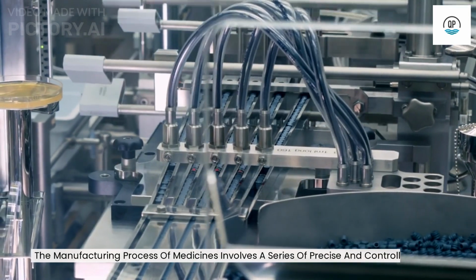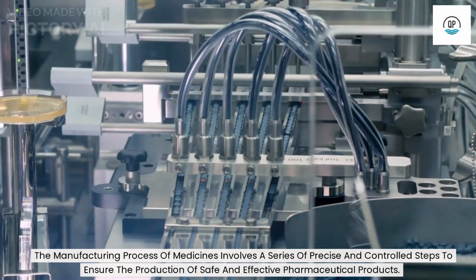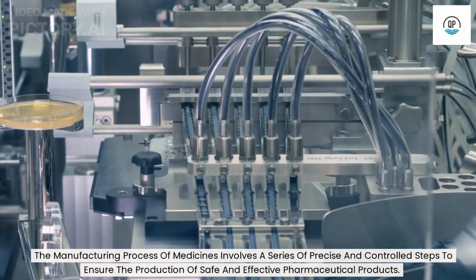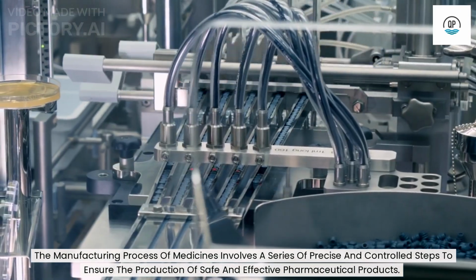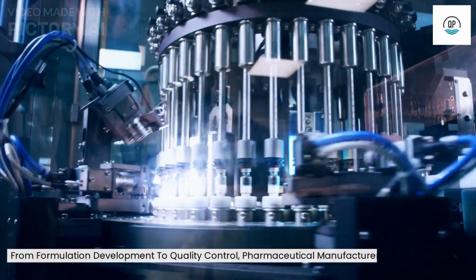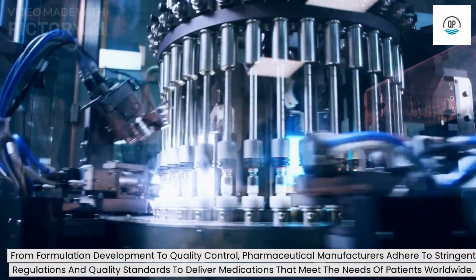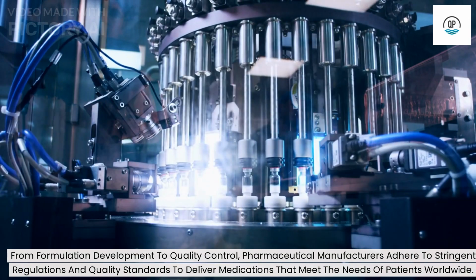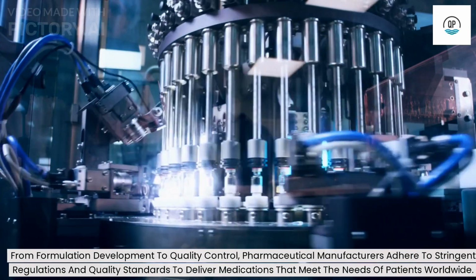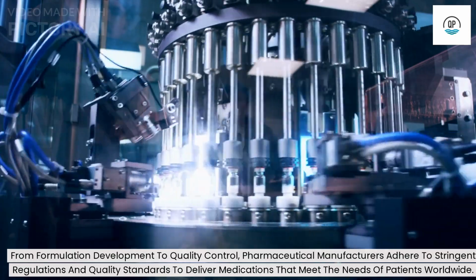The manufacturing process of medicines involves a series of precise and controlled steps to ensure the production of safe and effective pharmaceutical products. From formulation development to quality control, pharmaceutical manufacturers adhere to stringent regulations and quality standards to deliver medications that meet the needs of patients worldwide.